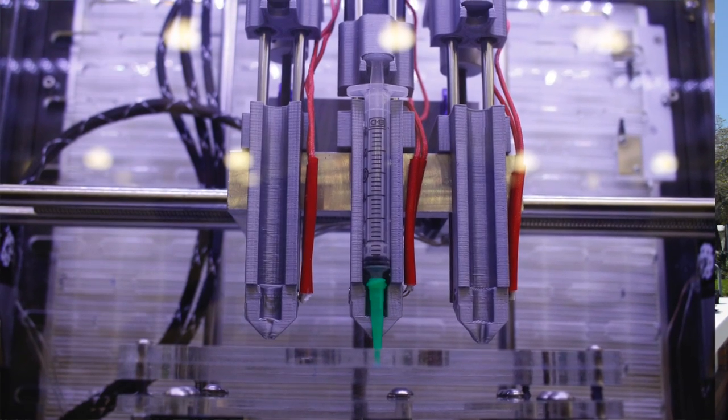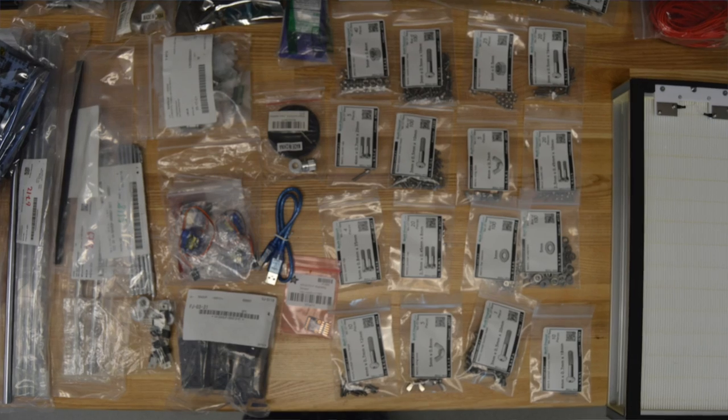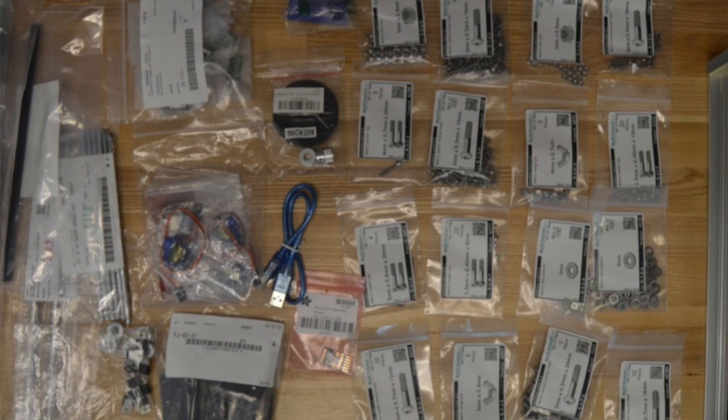The problem with this is that it's very restrictive — you've only got a small opening into the cabinet and all work has to be done inside that cabinet. What our team is trying to do is make a standalone bioprinter that can work outside of a cabinet, as well as increasing control over environmental parameters such as temperature, humidity, and the carbon dioxide concentration within the printer.